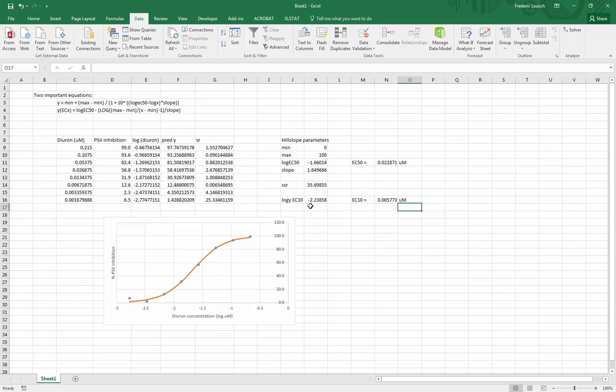I think that's it. So this is how you use Solver to calculate EC50 and EC10 from a nonlinear curve.